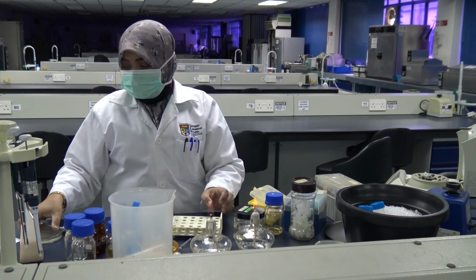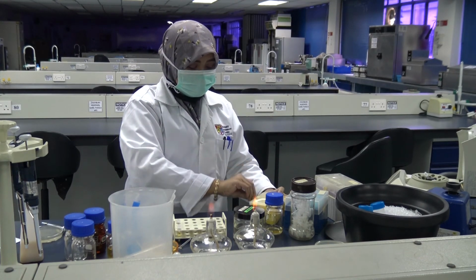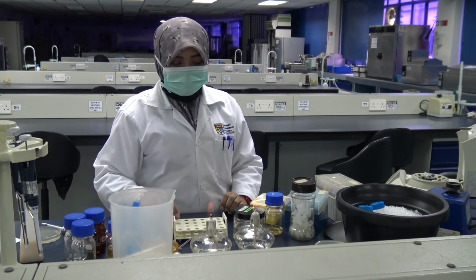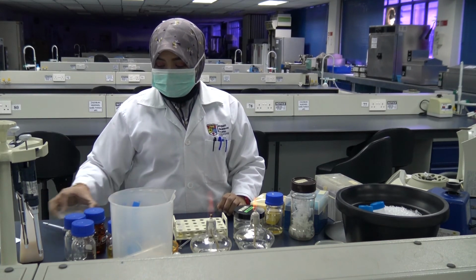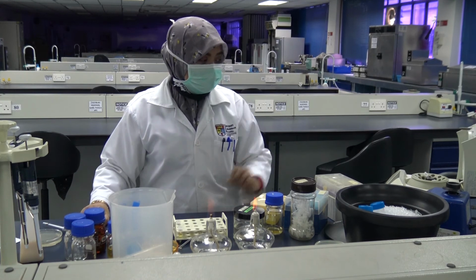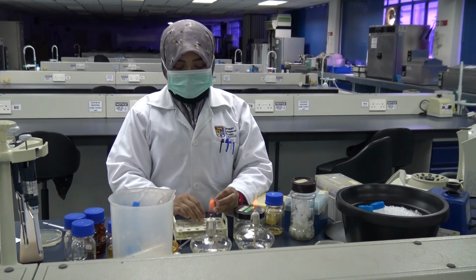Before this, we did dilutions of 10 to the minus 0 to 10 to the minus 6. We will repeat what we've done just now, which Fonzyma has shown. She has spun down, using a centrifuge, the tubes containing 10 to the minus 4, 10 to the minus 5, and 10 to the minus 6, which means all the cell pellet would have already sedimented to the bottom.